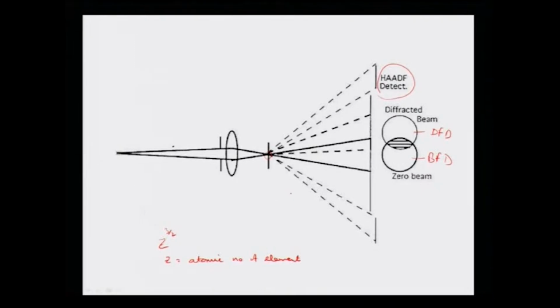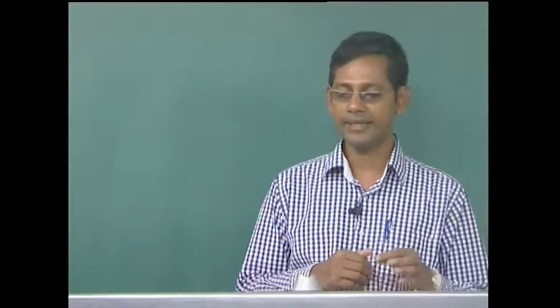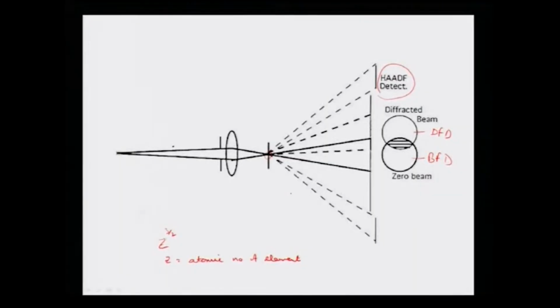When the sample thickness is high, the HAADF signals are very good; when the sample thickness is small, the HAADF signals are bad. That is why one needs to use a very high intensity incident beam, focused very properly on the sample by the objective lens, so that the HAADF detector intensities for the thin regions of the sample can be comparable.